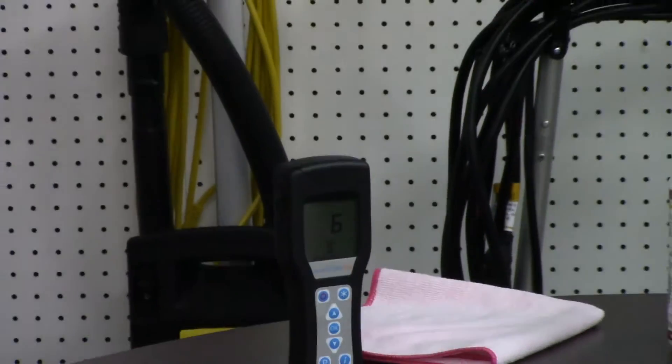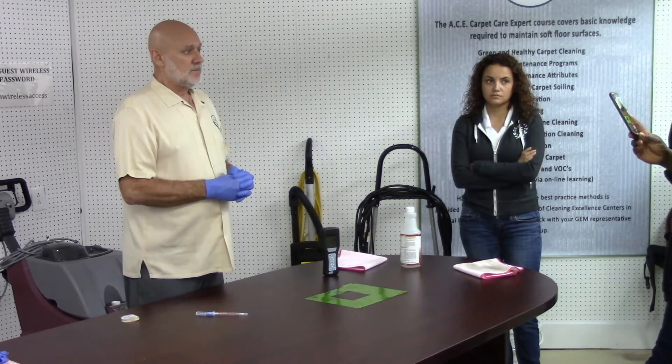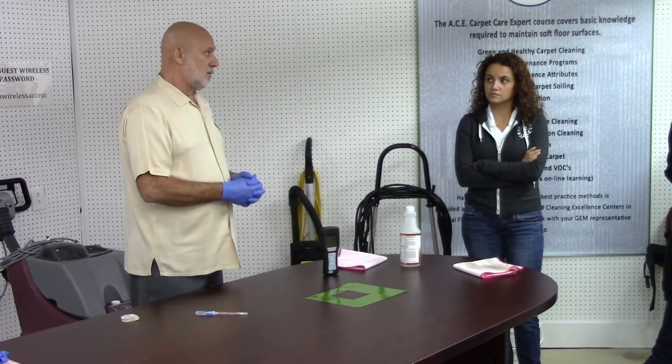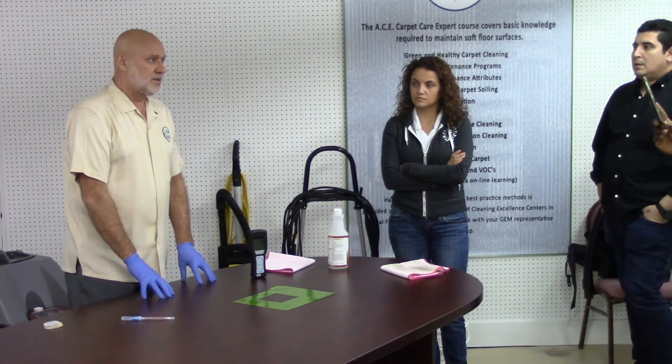What this is doing is giving me a baseline of what is on that surface that I can't see. The reading is 29. On this metering device, 30 is considered dirty if you're preparing food. This is a table where we had food — it was already prepared, a cold cut sandwich. Had that sandwich come in contact with this surface, would it have been appropriate to consume?